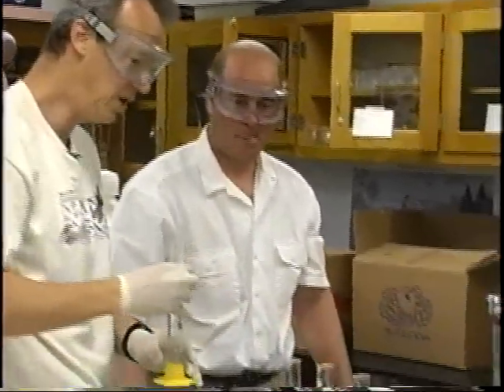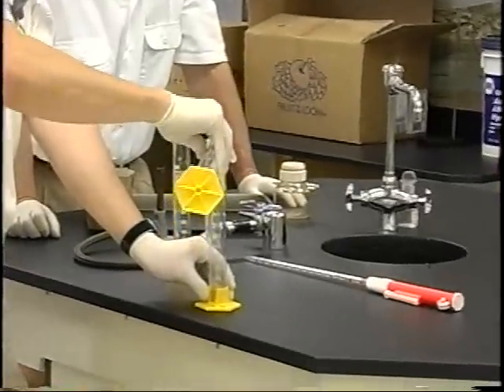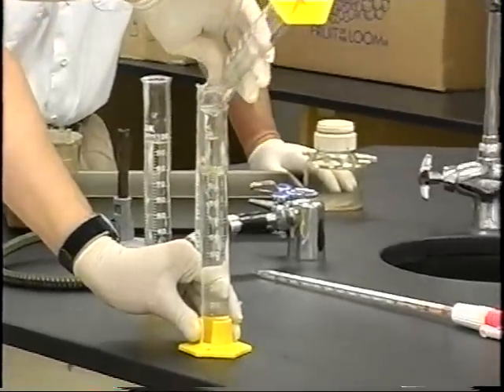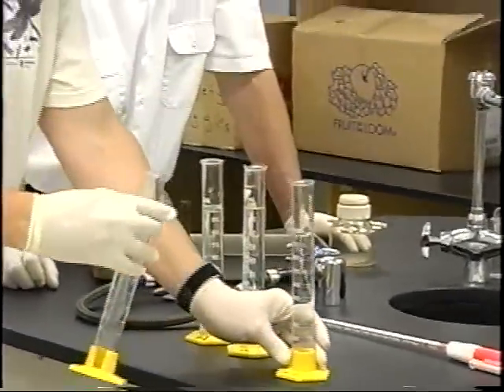Thank you very much. You've also got to be careful since you're working in a sterile work area. Your classmates might be interviewing you or talking to you, but keep them out of here. Don't let them come over here and contaminate the table.